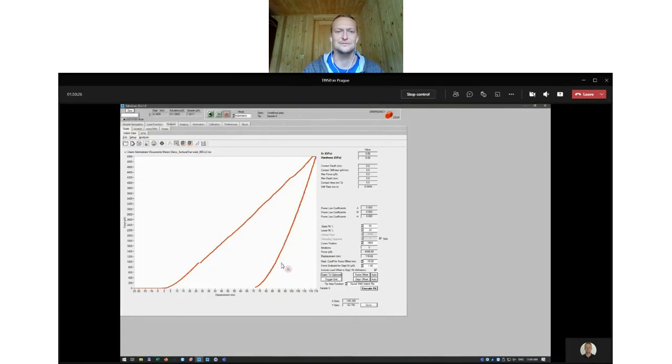So we see that at 5 millinewton contact force, or maximum force, we reached over a 100 nanometer indentation displacement, and then unloading. So the residual indentation depth is about 70 nanometers. And so from 70 to 115 or 119, that's the elastic recovery of the material. So that's the elastic deformation that went back. And from the unloading segment, we can get the elastic modulus, or the information about the elasticity, because the unloading data contains the information about the elastic recovery here.